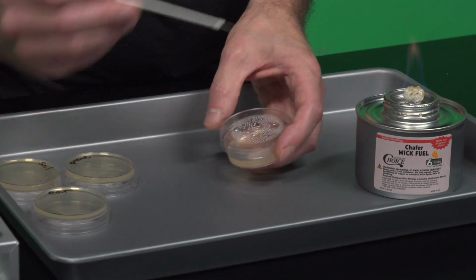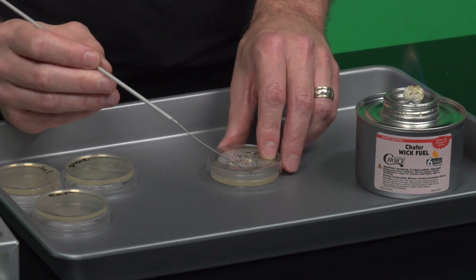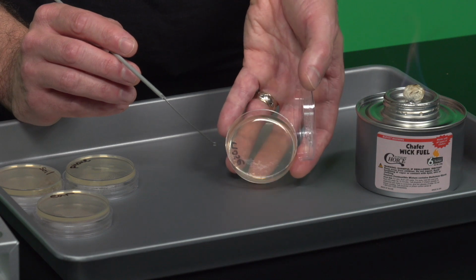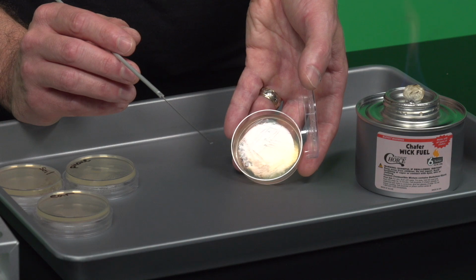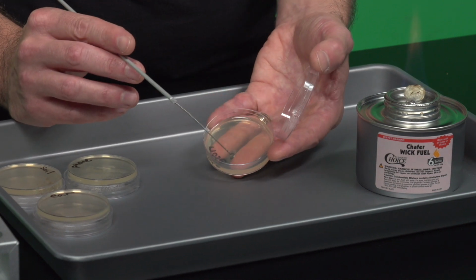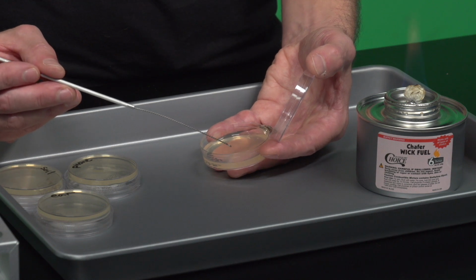So the next thing to do is use the loop, sterilize it, let it cool, and now we're going to be doing the 4th quadrant as soon as this is cool enough. I'm just looking to see if I can see my quadrants, and there you can see the different areas that have been already struck. Again, patience is key. Don't start going right away.